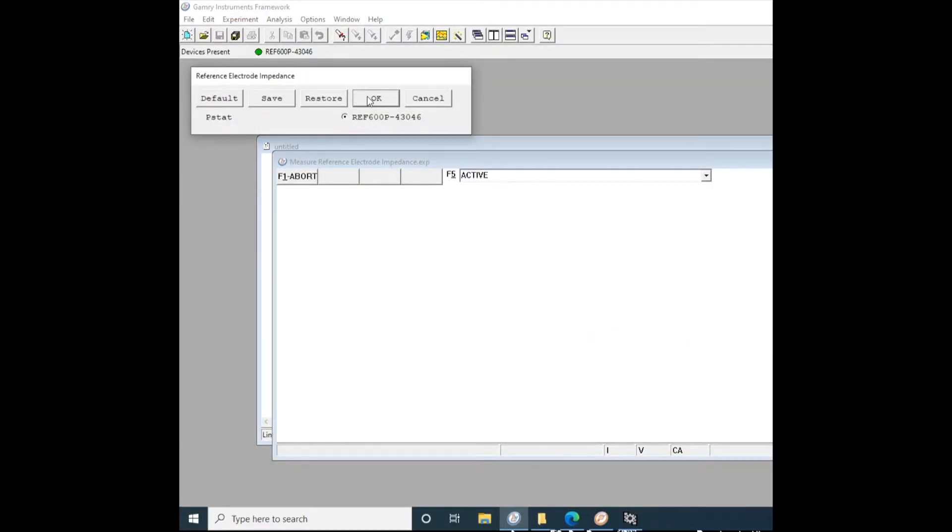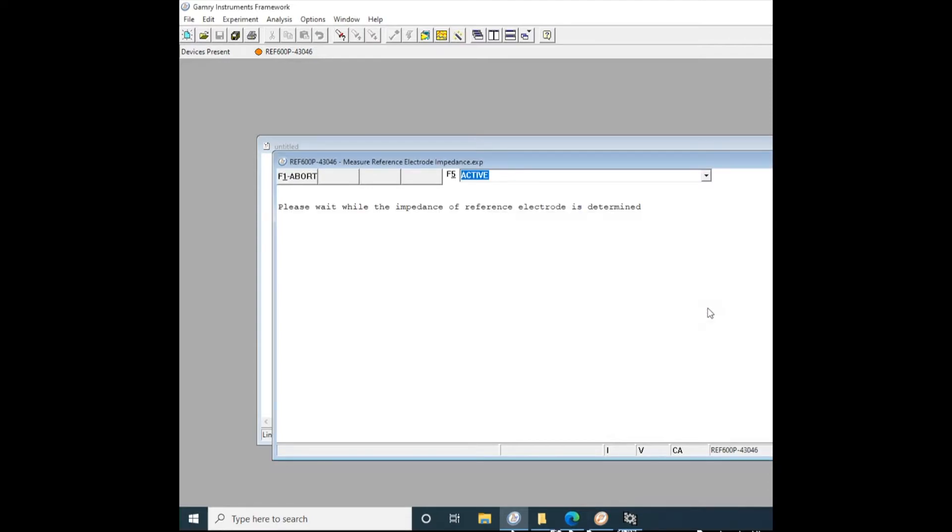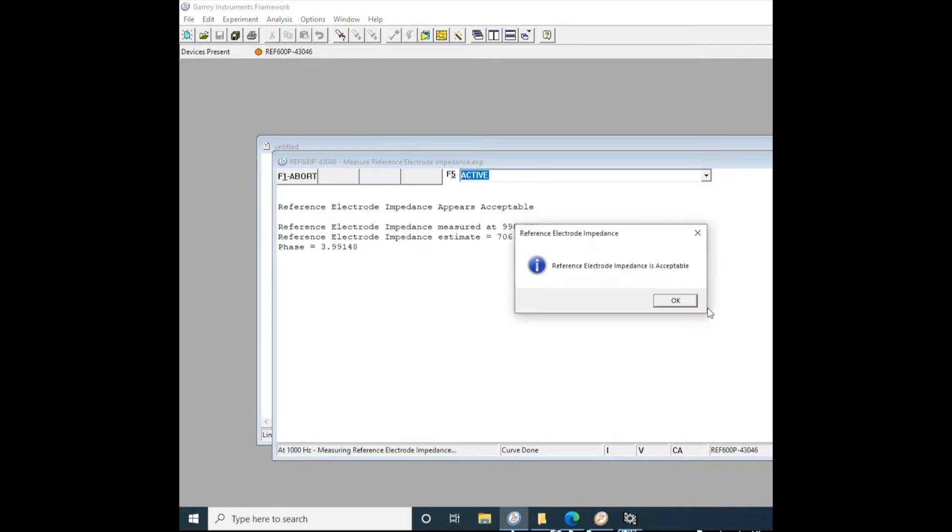It's a really quick experiment to start. You don't really need to select any parameters. It'll remind you where to hook everything up to, and then really quickly measure the impedance. It'll tell you that it's acceptable and then you're good to go.